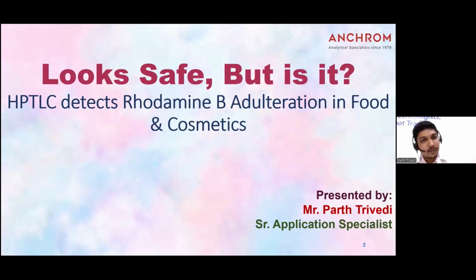So, today we are speaking about what is rhodamine. It looks safe, but is it? HPTLC detects rhodamine B adulteration in food and cosmetics.